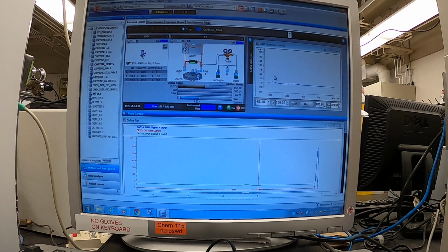And so like I said, down here at 210, but methanol absorbs down here in the HPLC. So we don't really get a true measure. And then you saw the other one right here about 273. We've got a nice peak. I don't know that we have electrophoresis occurring. But this is a shortened capillary, so I expected it to come out fairly quick.